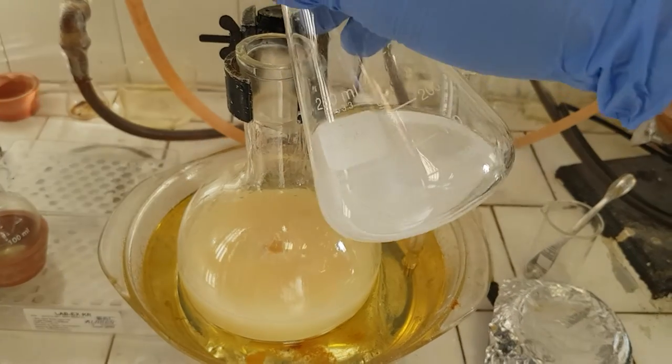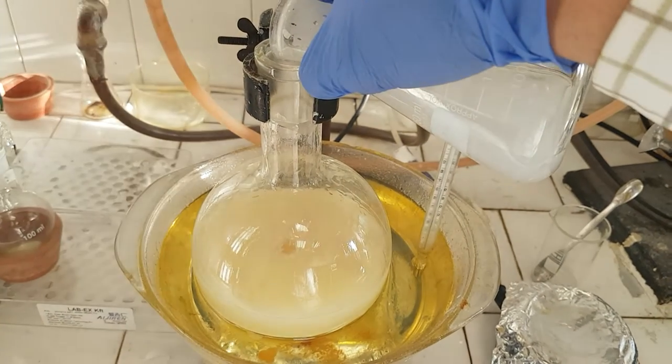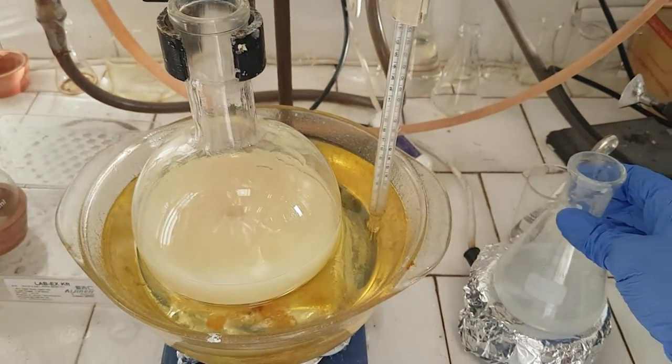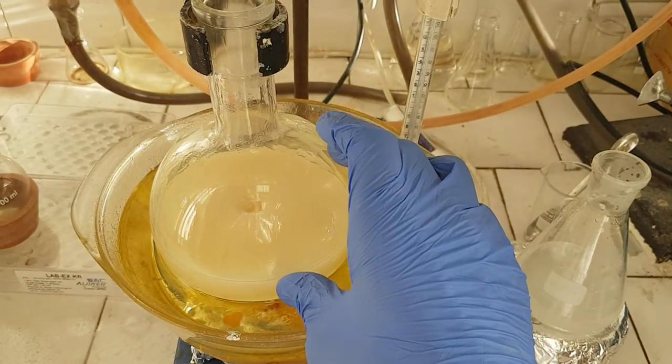You need to add the neutralizer very slowly. You can also control the pH.